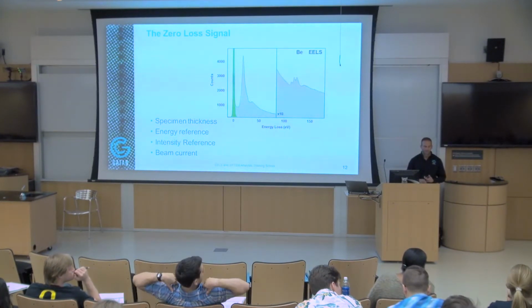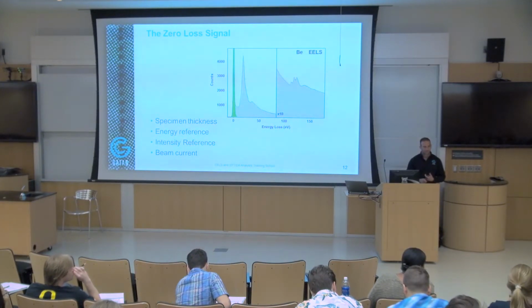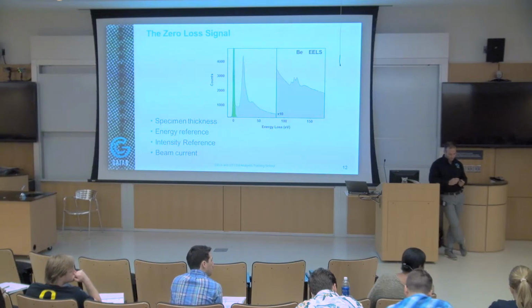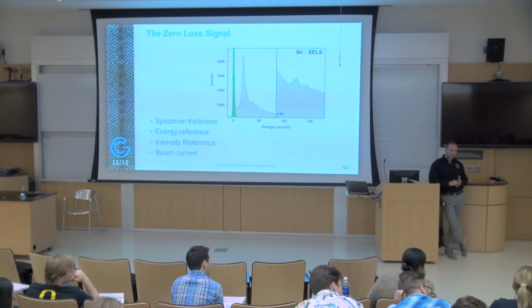The software assumes that you're dealing with a free electron gas, and with the free electron gas there are some rules that you can use to make guesses at what the scattering density was. And what you're hoping is that the error is logarithmic in what this thing actually was, because it isn't really an electron gas. So the approximation is good for materials that have band structures that look like free electrons, and it's pretty terrible for things that are not. So they'll misbehave for d electron systems and f electron systems, and they'll do a very good job for things like silicon and aluminum.